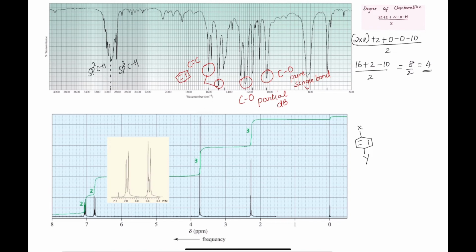You can clearly see that there is one methyl group in the upfield region, and one other methyl group in the far downfield region, about 3.8. The peak around 3.8 is for OCH3. When a methyl group is connected to an oxygen, it shows a singlet around 3.8.